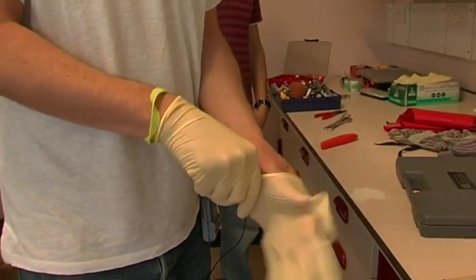I'm just putting on some gloves before I pick up a bottle of the most toxic substance in this laboratory, which is mercuric oxide. Really nasty stuff.